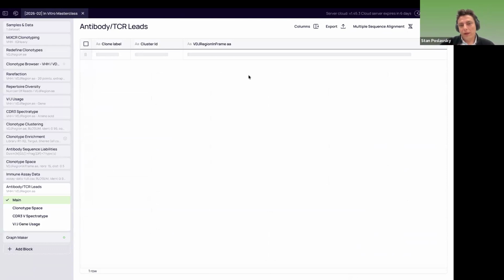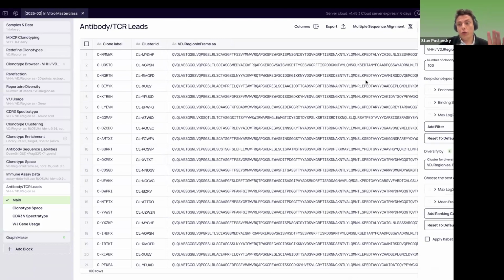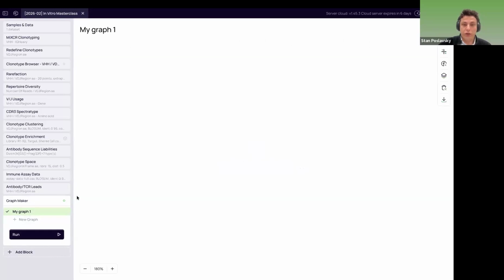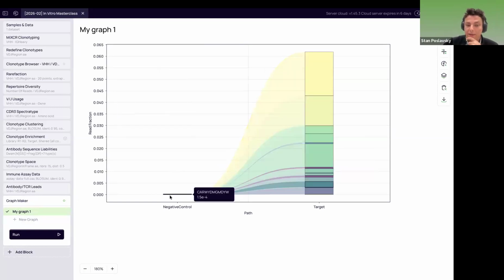Okay, it's loading. Yeah, done. So we rebuilt our lead panel using those criteria, using the enrichment scores and the diversification with the clusters. Now our lead panel should be better. And at least the top abundance trap is the thing that we should avoid. Let's look back at our visual where we compare the proportion, the presence, where we check the presence of our selected leads in the negative control. And you see that it changed.